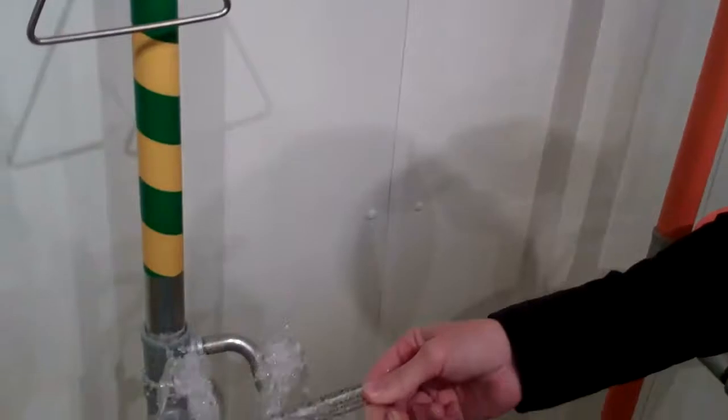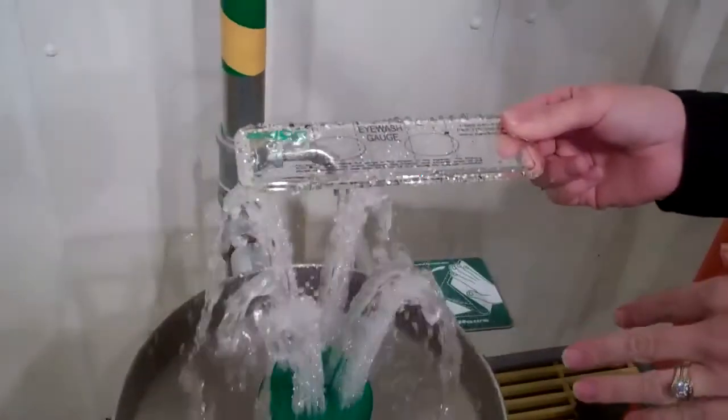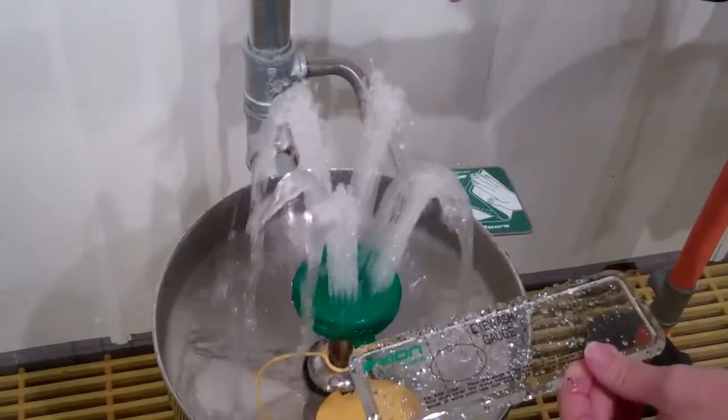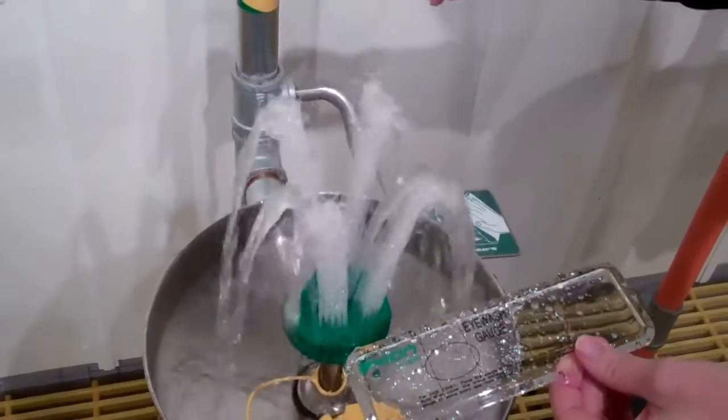So you want it to be right and of good range. You also need to be careful making sure that the flow isn't too low, because you want to be able to have your eyes in there and be able to flush them properly.